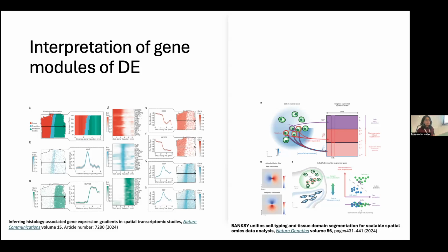I have tried to perform gene expression analysis on all 3 because I thought maybe the third matrix would give me something interesting because it's based on the azimuthal Gabor filter, which looks at the gradient of gene expression, but it was really giving me garbage. The only thing that was making sense was the first matrix, the original single cell gene expression matrix. But that could be because I was very naively applying the standard differential expression analysis from Scanpy, so maybe I should have done something different. So these are things that you have to think about.